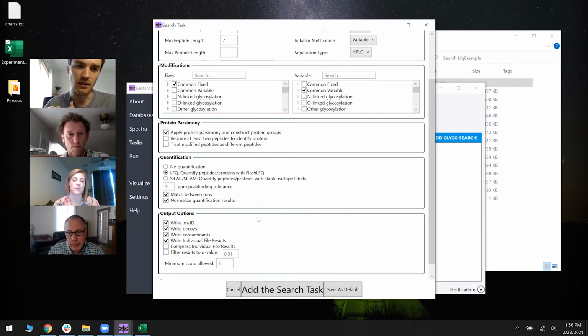And that uses retention time alignment between samples. And then normalization is an intensity correction, basically, where there's typically some drift in measurements between samples. So if you run 3 samples in a row, even the same sample 3 times in a row, the instrument can drift a little bit, and the intensities can decrease over time. And the other thing is that if you're running even seemingly identical samples, but they're different samples, there can be sometimes very slight systematic differences in how much total lysate you inject.